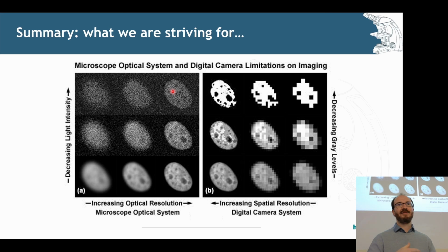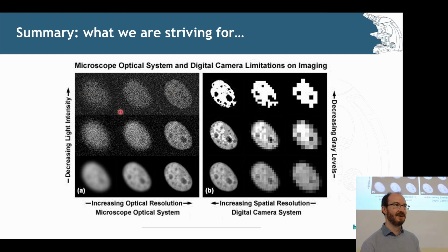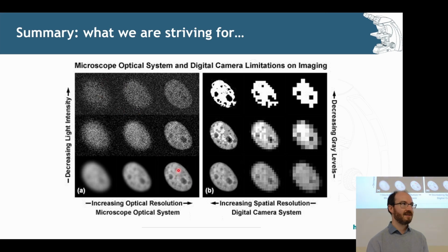It kind of arrives just randomly. And if you don't capture enough light, then there might not have been enough photons that arrived for that area that you're trying to image. So you need to set the brightness of your laser or whatever high enough so that there are enough photons that end up reaching your sensor, so that as an averaging out of the effect of what's going on here, with enough light, you end up actually seeing the structure properly. So that's a little bit of a nuance here.